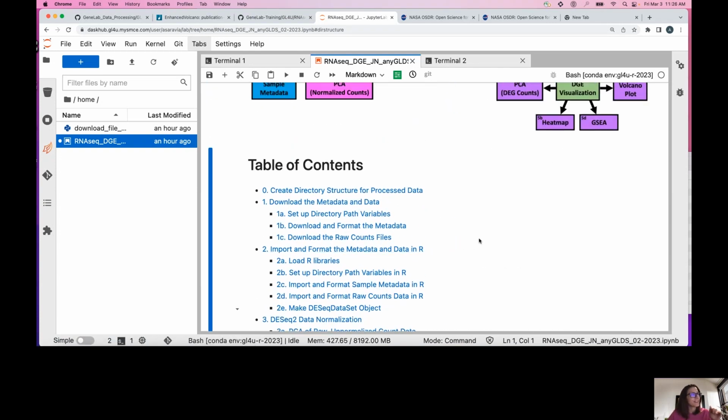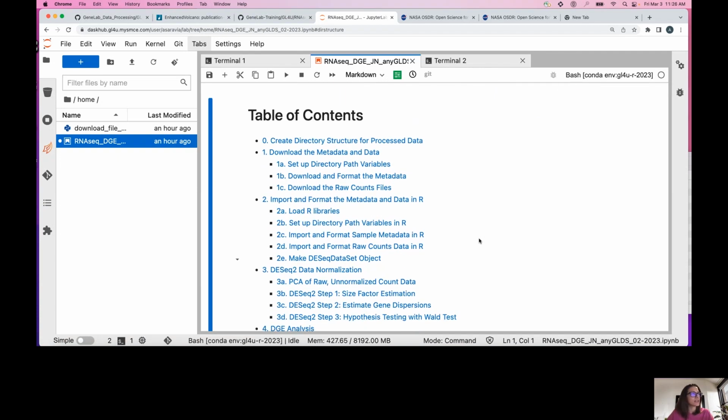The other awesome thing that I did this time around is, before, if you remember, we were going back and forth between a Python kernel and an R kernel. We were running things using the Python language or the R language, but when we were running things in Python, we were actually running bash or Unix commands from the Python kernel. We had to add that exclamation point in front of things and sometimes weird symbols. Well, it turns out that you can actually incorporate a bash kernel into Jupyter. That completely got rid of having to do anything weird because we were trying to run bash commands with Python. So now we actually have a bash specific kernel.